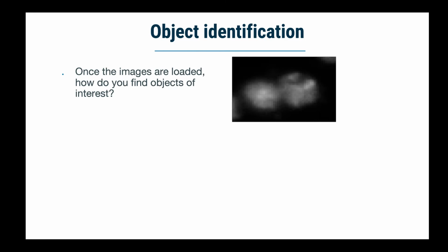We've gone through this a little bit in the introduction, but today I'd like to go through this in a lot more detail, show you a lot more examples in CellProfiler of different ways we can configure segmentation, how all of this gets set up, and then how you can adjust it so that even when you have a few special cases in your experiment, you're able to handle those just fine.